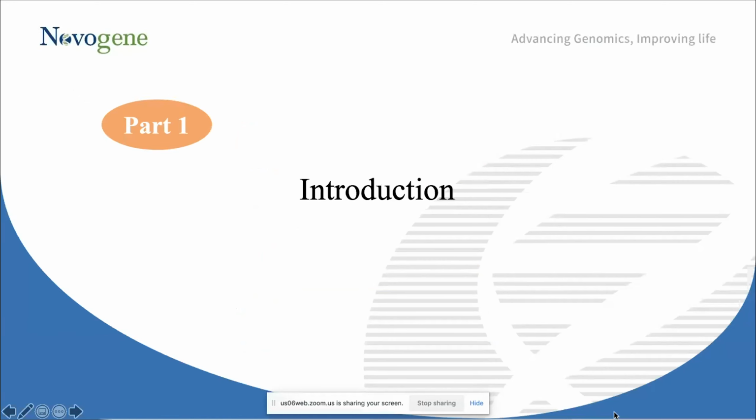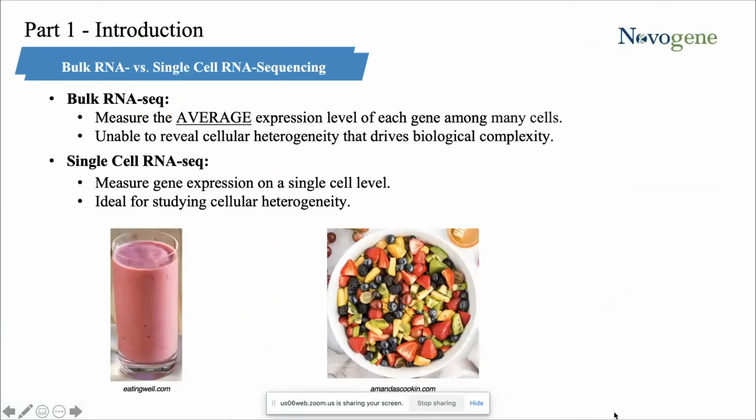First, introduction to 10x single-cell RNA sequencing. I wanted to start off by talking about the differences between traditional bulk RNA and single-cell RNA sequencing. I like this analogy from 10x genomics and will borrow it today. Bulk RNA sequencing measures the average gene expression levels in a group of cells, much like comparing different batches of fruit smoothies that were blended from many fruits.